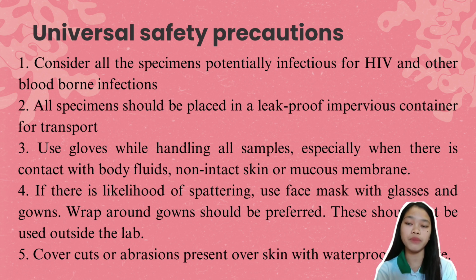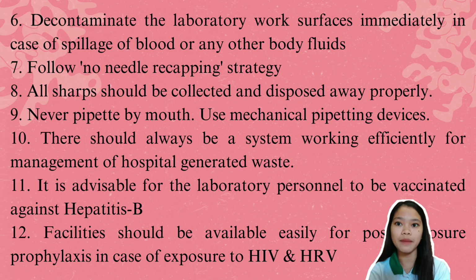Next, if there is likelihood of spattering, use face masks with glasses and gowns. Wrap-around gowns should be preferred. These should not be used outside the lab. Next, cover cuts or abrasions present over skin with waterproof bandage. Number 6. Decontaminate the laboratory work surfaces immediately in case of spillage of blood or any other body fluids.